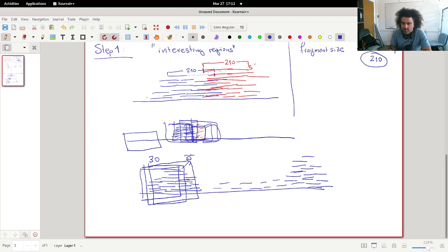Now some reads are excluded perhaps, and some other included. Let's say that in the third one we have 38 reads, and therefore we can form a series of reads inside such a window of 210 base pairs. So let's say that this series of numbers is 30, 35, 38, 41, and then 39, and then 37, and then let's say that after that we exit this region, then we will have 8, 7, 6, 5, and so on.